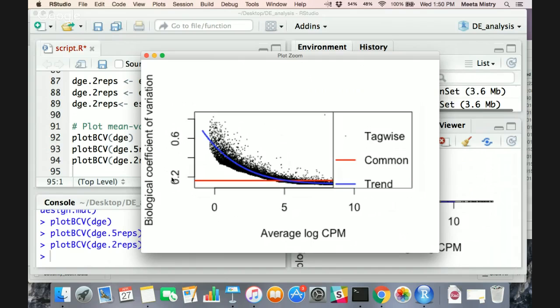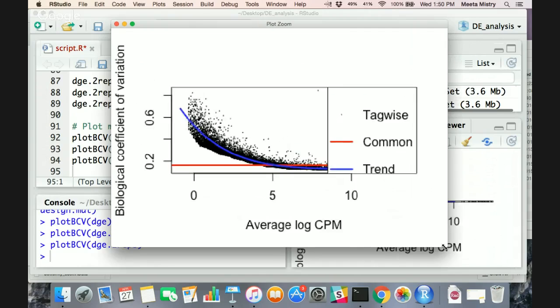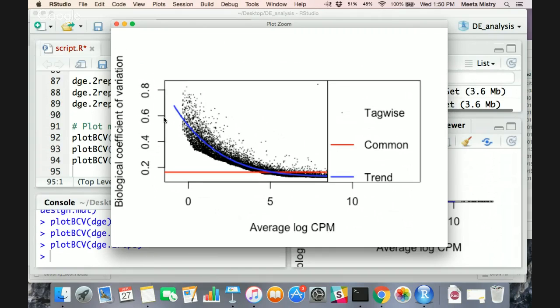These are things you should look into too when you're working with very tiny data sets. Usually, if you're in the range of 2 or 3 data sets, this isn't too problematic. But if you're seeing a lot of within group variation and the between group variation you're looking for is very subtle, that signal is very small, then it's going to be very hard to deduce signal from noise.